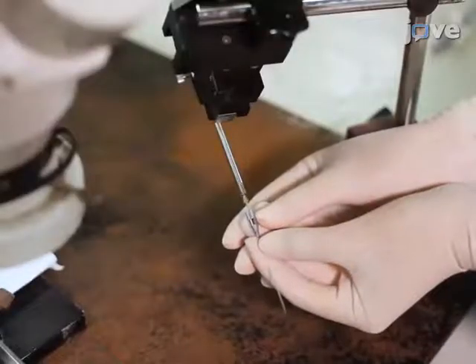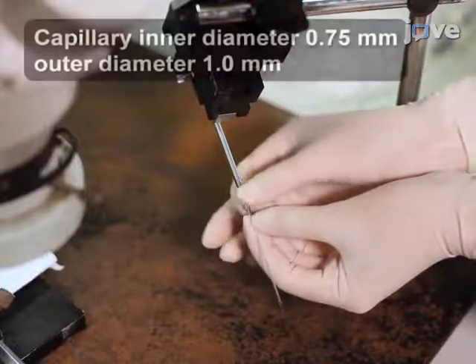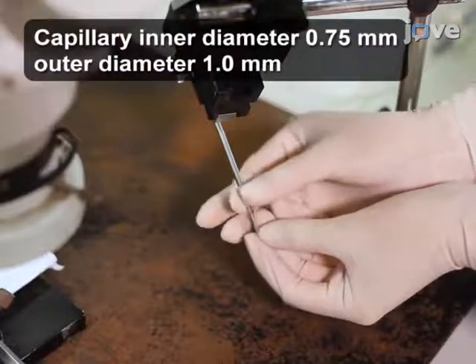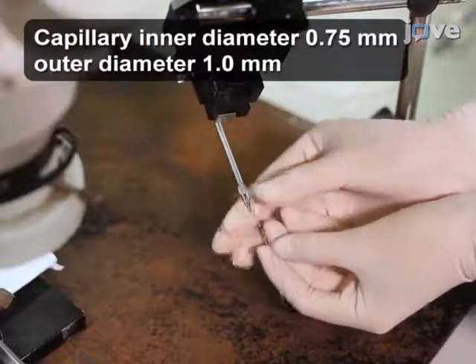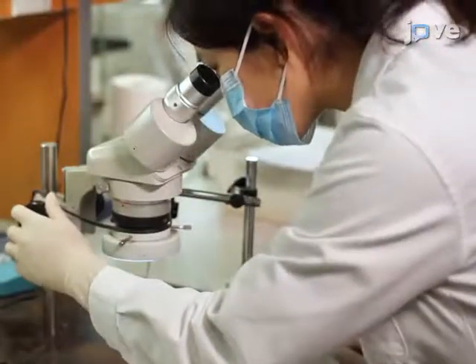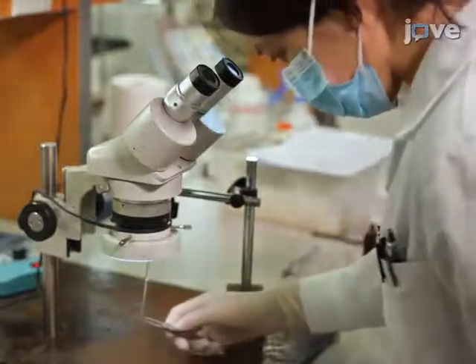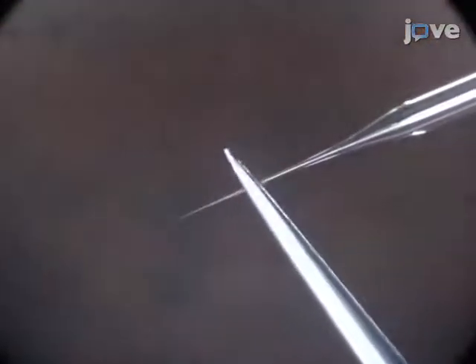Begin by placing a pulled glass capillary into a capillary holder which is firmly mounted on a micromanipulator. Next, while viewing through a dissecting microscope, use straight forceps to break the tip of the sharpened capillary so that the inner diameter of the broken tip is about 10 to 20 microns.